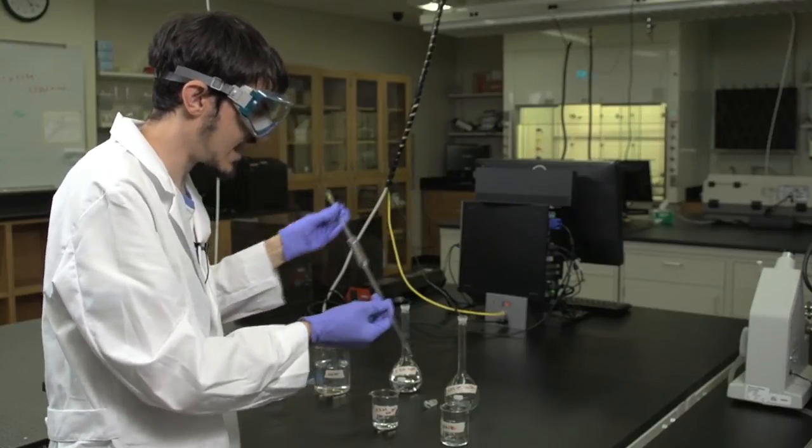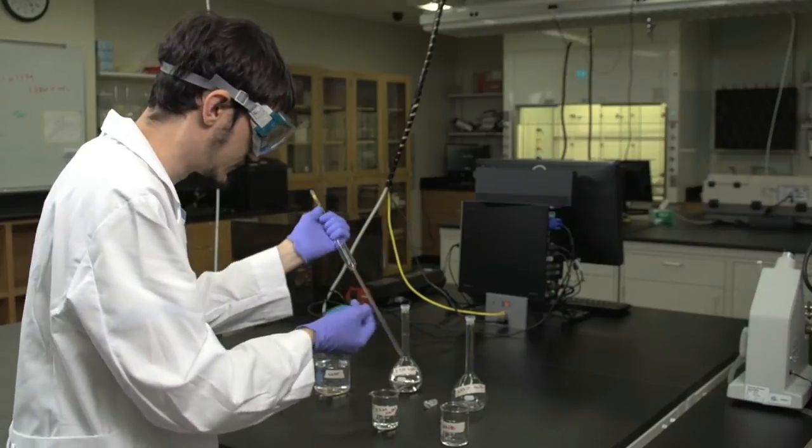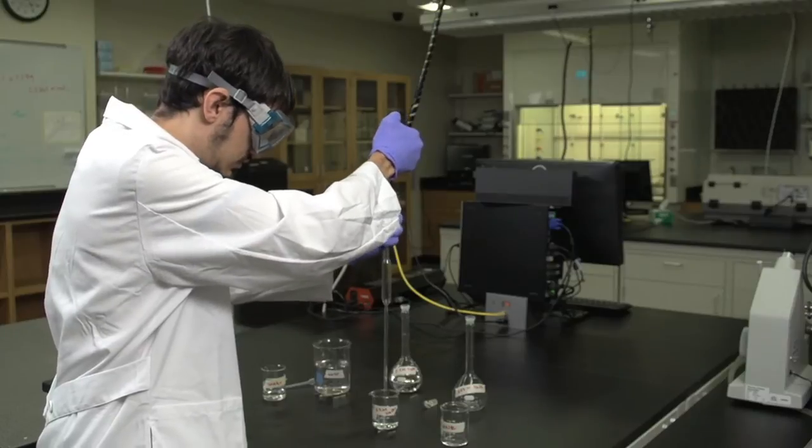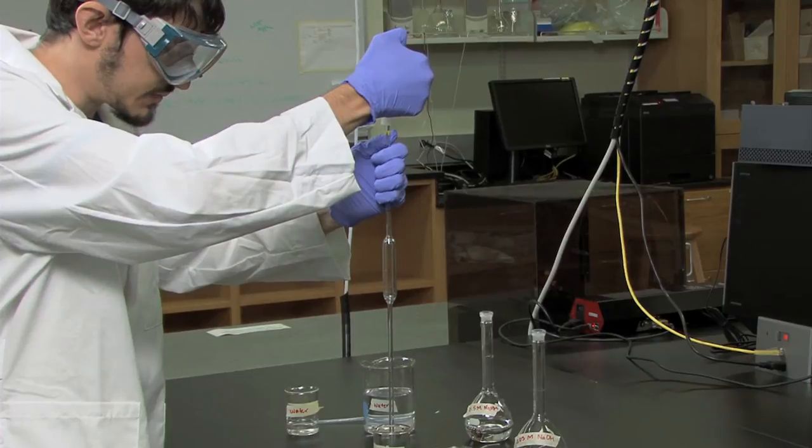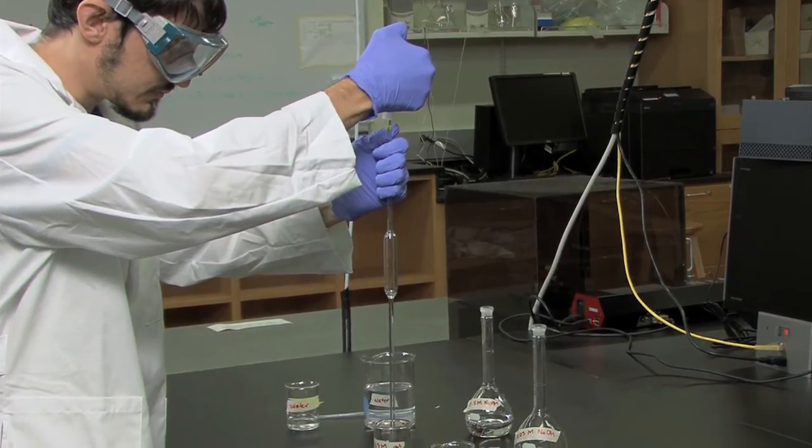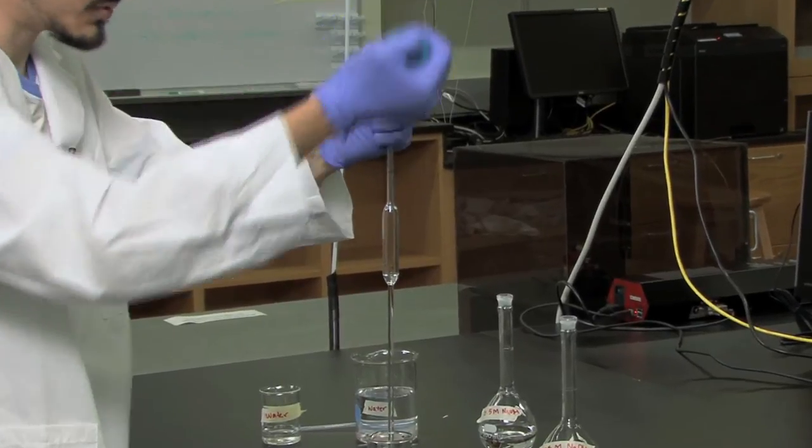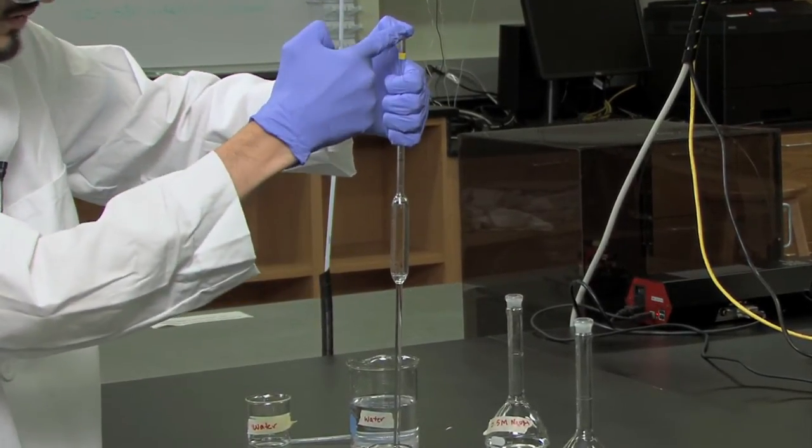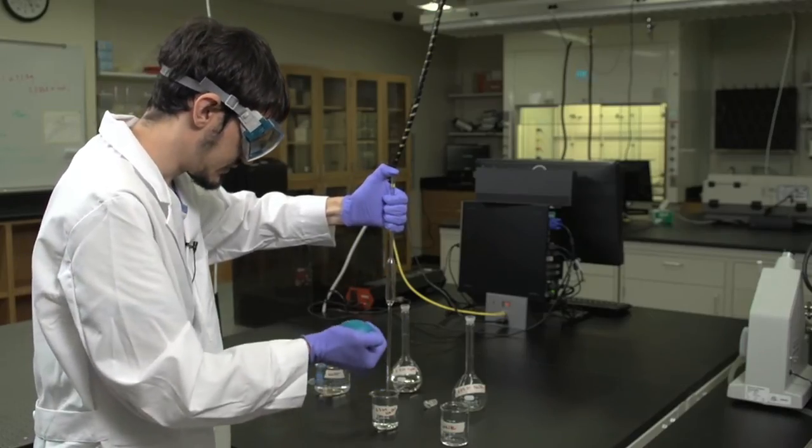Now you are ready to obtain the actual volume that you are going to use to make the diluted solution. Draw up the solution into the volumetric pipette. You may need to have several squeezes to do this, and what you want to do is put your thumb, or one of your fingers, firmly over the top to create a vacuum.